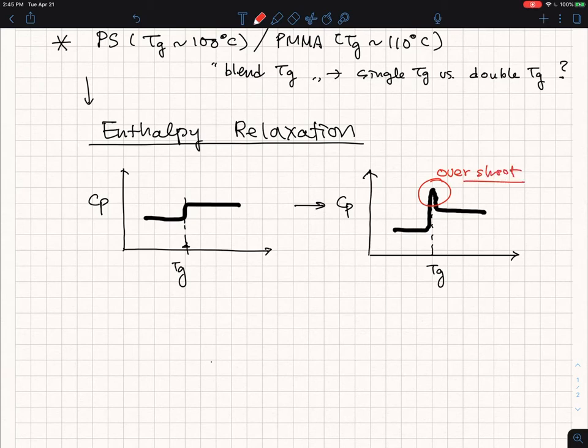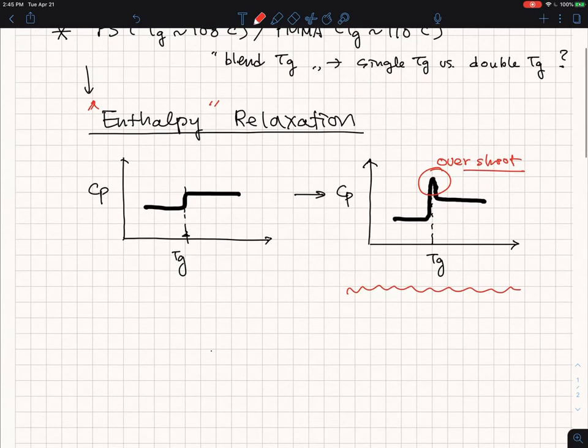So this is what we call the overshoot. It is not really big as a melting peak, but this overshoot is what looks like, sort of looks like an enthalpy relaxation. And sometimes you are seeing this, and you can kind of promote this behavior by doing the, this is a temperature.